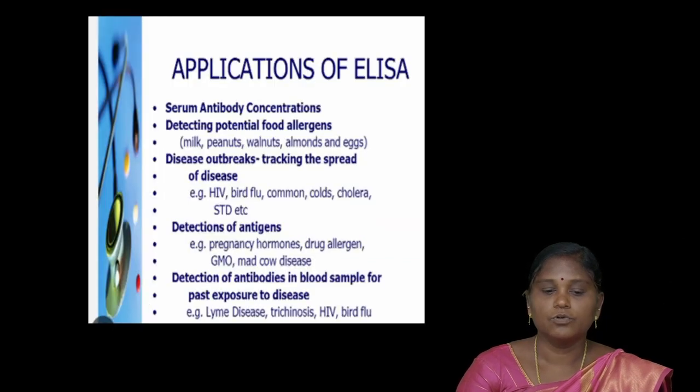And then you should know the general applications. ELISA is an advanced technique, and it is mostly used in the medical field. So what are the applications in this field? One is that serum antibody concentration can be detected.